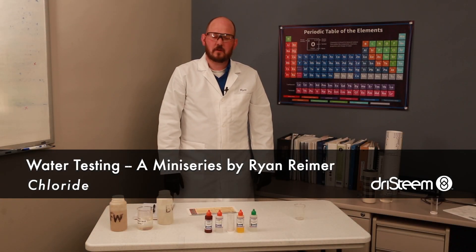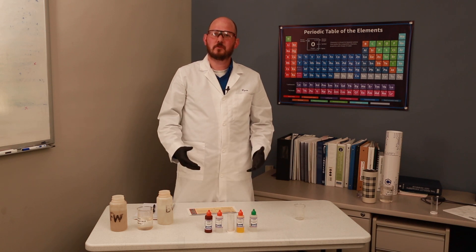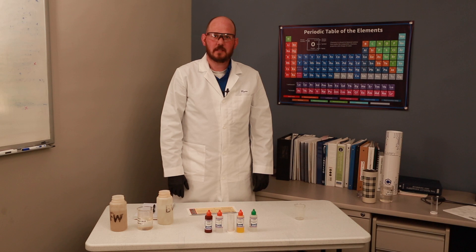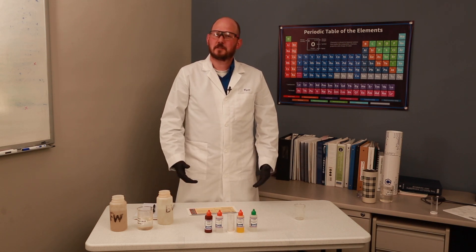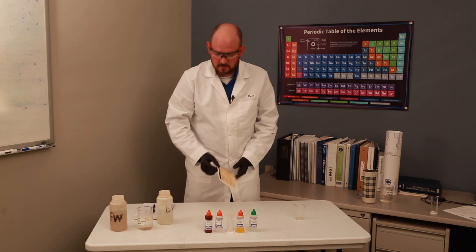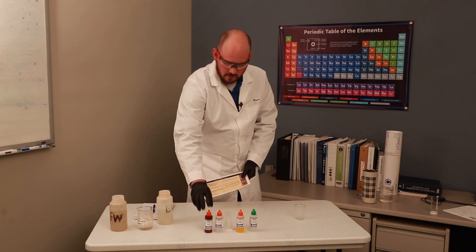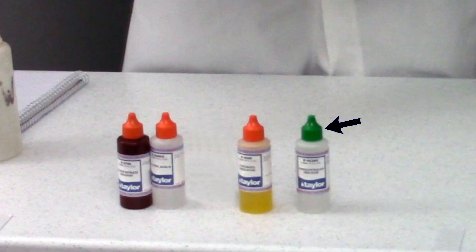Hello and welcome. Today we're running a chloride test. Chloride is not to be confused with chlorine - we're really looking at dissolved salt in this test. We're using a test kit from Taylor Technologies. The nice thing about Taylor Technologies is they color code their test kits. For this test, it's the orange test paper, orange vial, and orange caps. You'll notice there is a green one in there. Don't be alarmed - it's the phenolphthalein indicator, used for multiple tests.